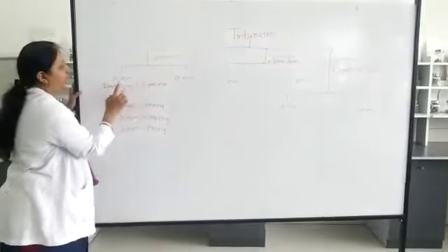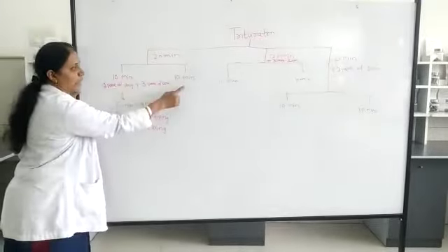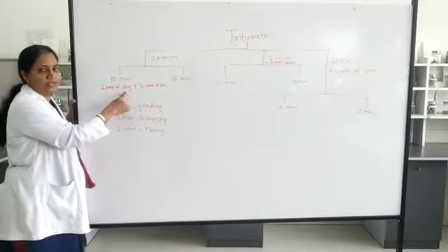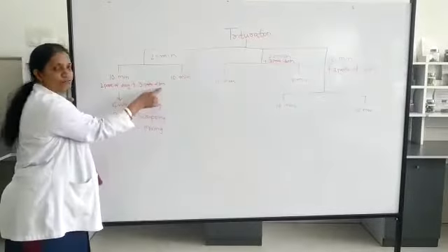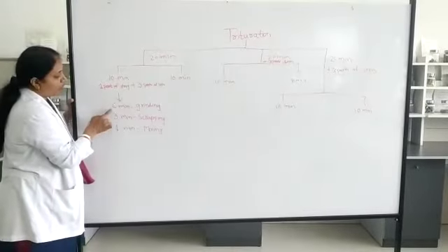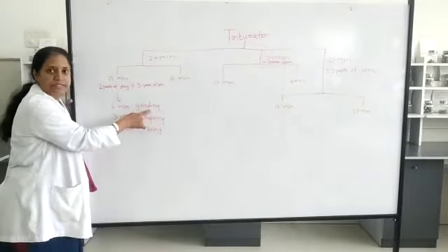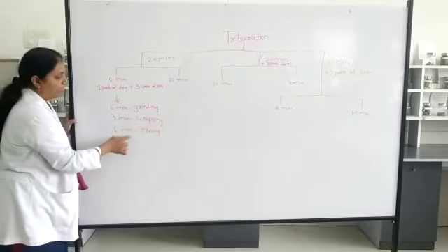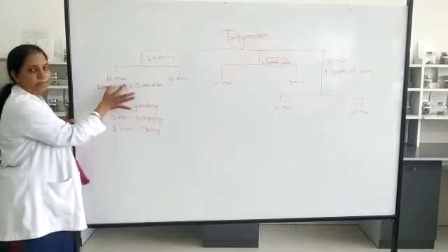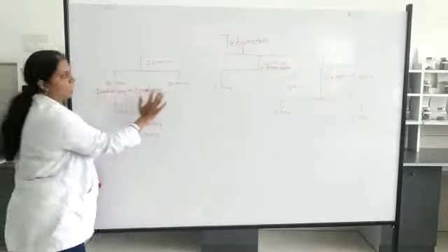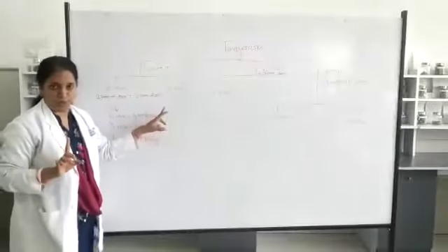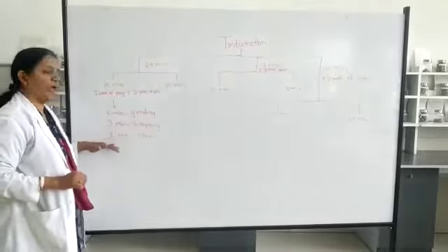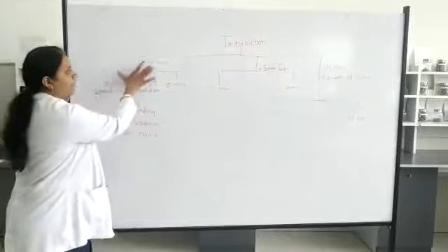Each 20-minute phase is divided into two cycles of 10 minutes each. In the first 10 minutes: grind for 6 minutes, scrape for 3 minutes, and mix for 1 minute. Then the same cycle is repeated for the next 10 minutes without adding any additional sugar of milk — 6 minutes grinding, 3 minutes scraping, and 1 minute mixing. This completes the first 20 minutes.